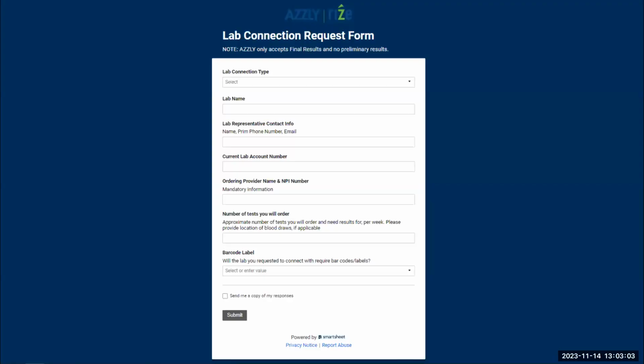Okay, perfect. And so Debra, being respectful of time, the process to set up a bidirectional. Andrew, I think you've got a slide that you can display on the process. Debra heads up the connections in working with LabSoft in order to submit.